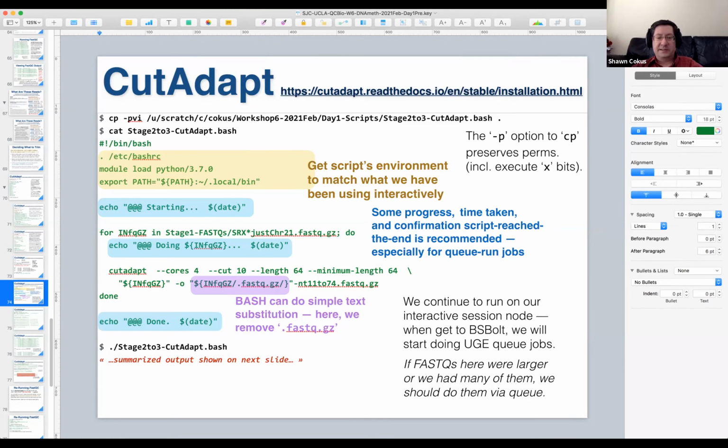This is the shell variable. I put the name of the stage 1 input fastq in. I usually try to name the variables a little better than Z or something. This is in, meaning an input file, FQ, fastq, and it's a gzip fastq. And then the -o is where you tell Cutadapt to write the output.